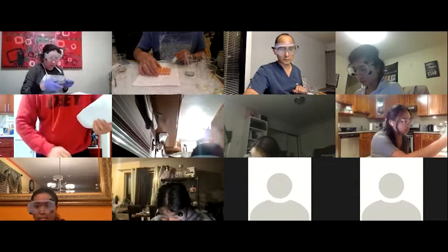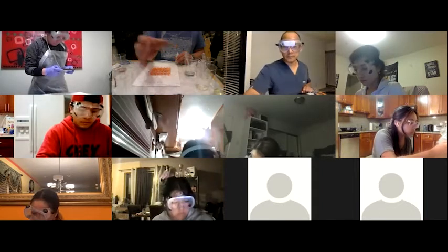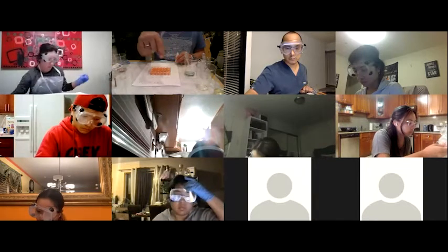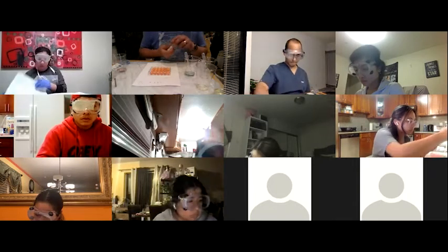You'll have to do some mixing. Just like with the titration last week, when you got a drop of sodium hydroxide in there, the solution turned pink in a small part of the flask, and then you swirled it and the color went away. Same sort of thing is happening here.